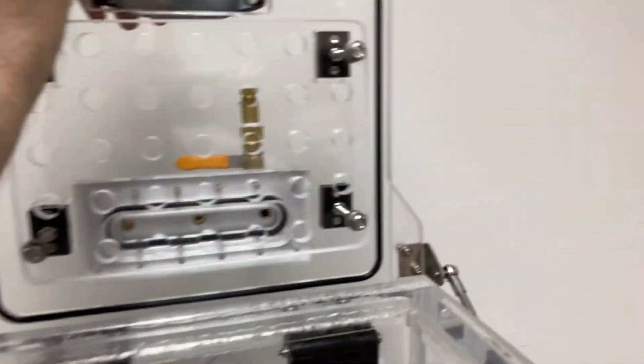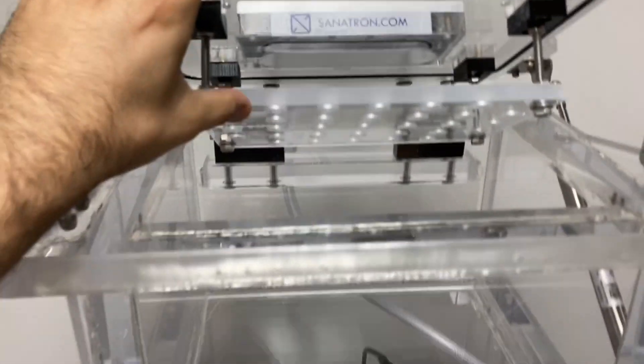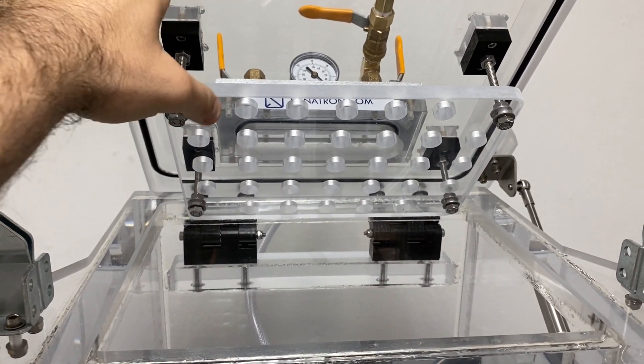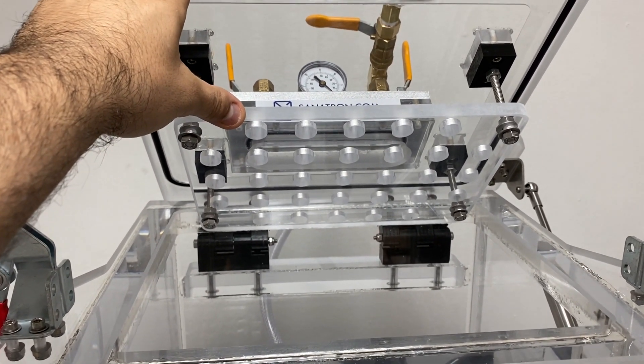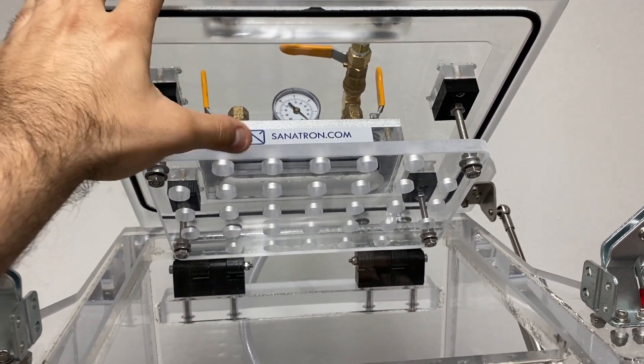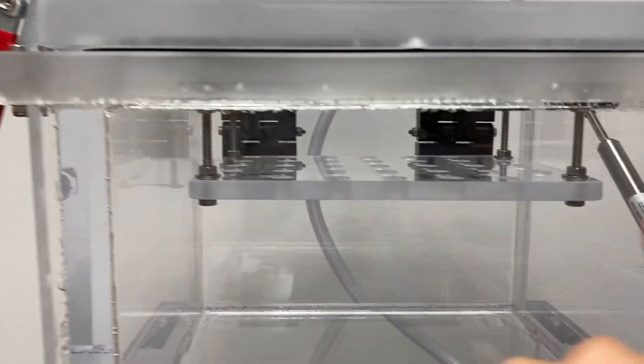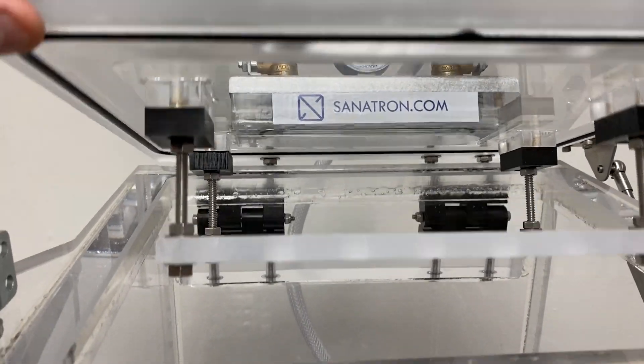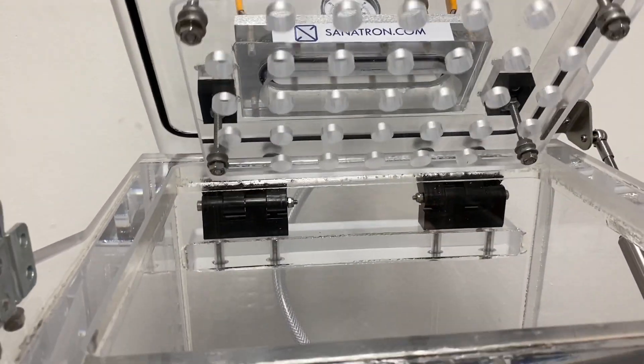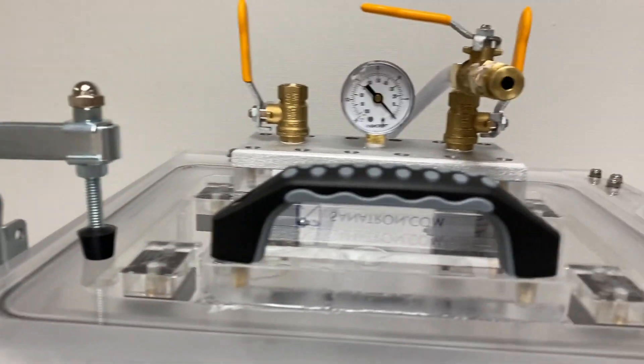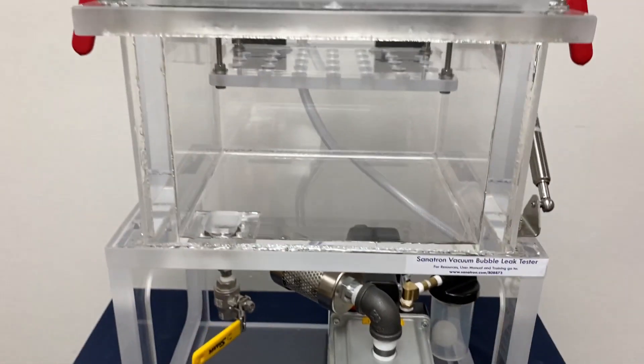Let me open up this lid and show you what else we have. This is a package restraining mesh, and what this mesh does is keep your specimen submerged in the water. If you ever pull a vacuum on a pouch or something that has air in it, it will expand and start floating upwards to the water surface. This prevents it from floating by keeping it submerged. This mesh is removable and adjustable, so you can adjust it and add longer spacers or shorter spacers.